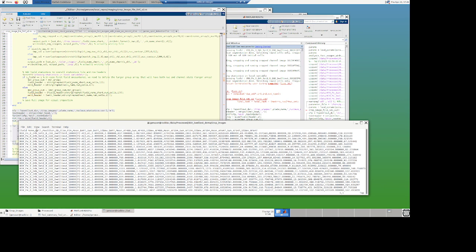I have the field name, the well. So field name, the well is A1. Position is position 1, ID 1. And then I have size. So size is 837. Then I've got the P2A 1.06. And it gets interesting. I have the mean DAPI, the sum DAPI, the standard deviation for DAPI, and I repeat that for each channel. Okay, so that's the first output.